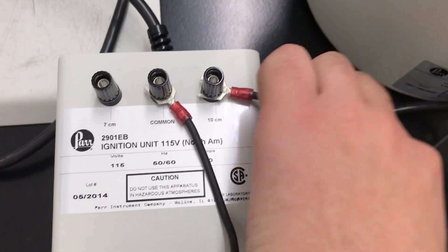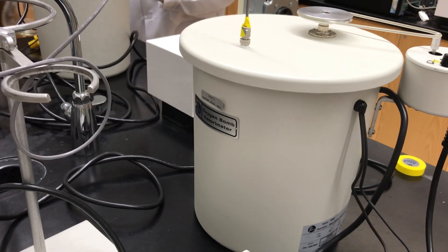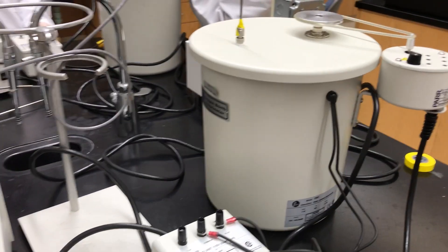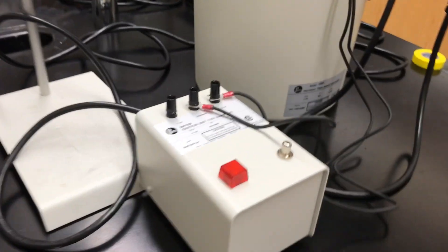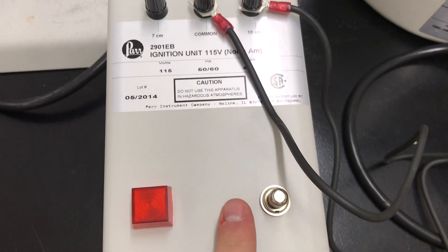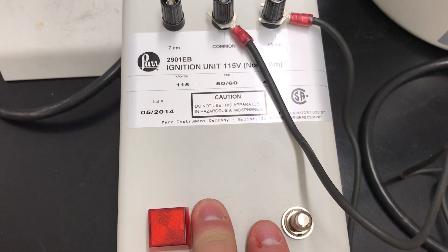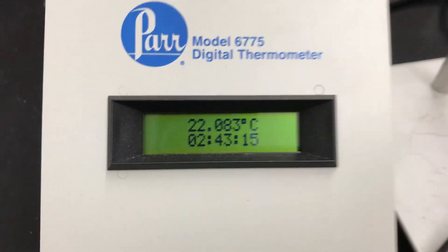Since we used 10 centimeters of nichrome, this is how we'll set up our ignition unit. For now, we're going to let this reach equilibrium and record the temperature. Once this reaches equilibrium, we'll press down this switch and hold it down for five seconds until the red light flashes, and then our experiment will be underway. I'm going to start recording the temperature on the readout right here.